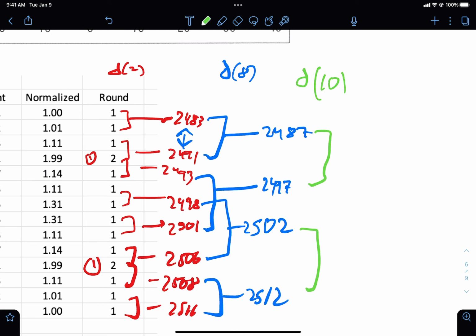All right. So where are our centers? Well, it's easy. 2487, this to 2497. The center is at plus 5. So this comes to 2492, and this comes to 2507. Okay, so two signals, they all came from ones, so they also are ones. So we have a 1 to 1. And what is their separation? Their separation is 15.